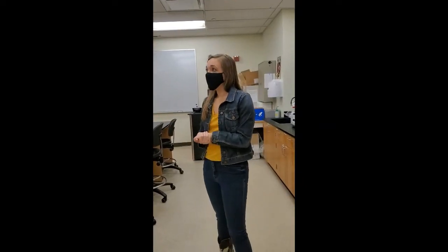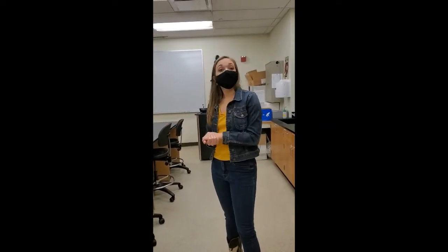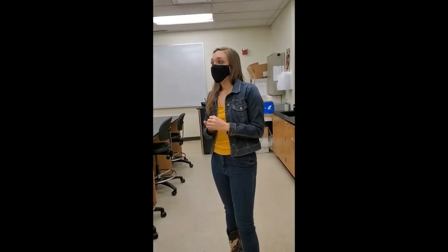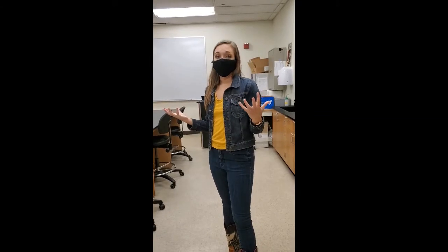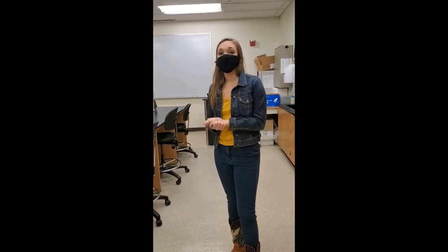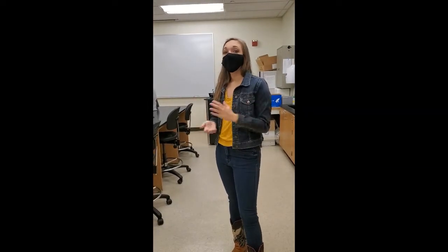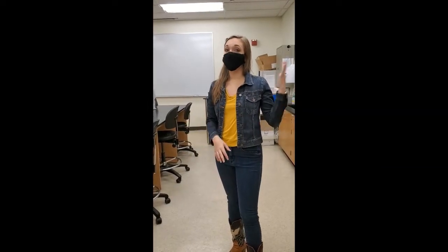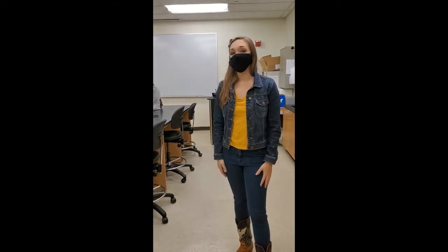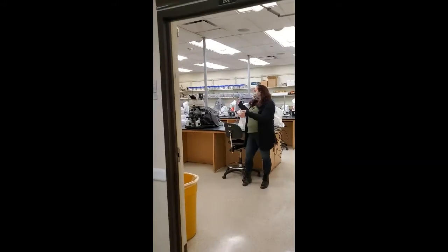Another feature of our biolabs is that we do mock cases. The TAs will set up a sexual assault case for you that you then work with a partner through. That gives you really good experience in learning how to not only go through a case from serology to the end where you're writing up a case report. So that's pretty awesome.